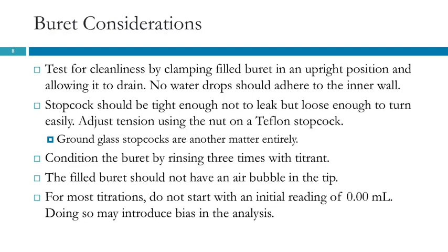We don't want to use a freshly washed burette with water inside of it because you add your sodium hydroxide and there's water in there, you've changed the concentration. So we add the sodium hydroxide, we rinse it through the tip and along the barrel, we drain it out. Now what we have left, instead of being pure water, is somewhat diluted sodium hydroxide.